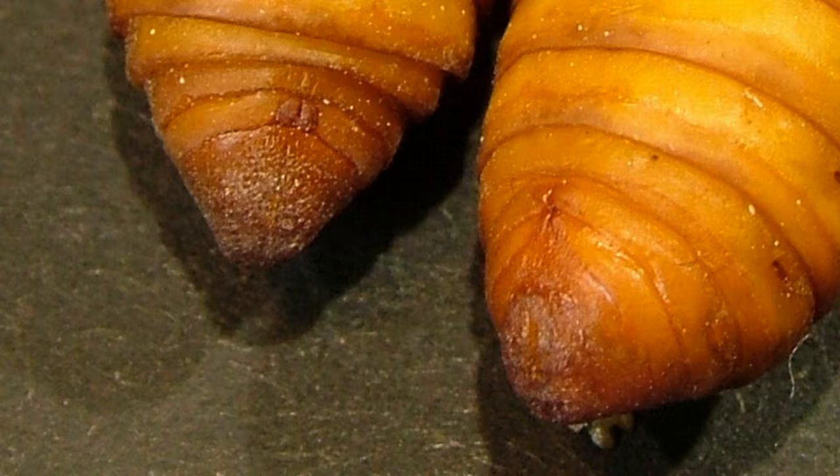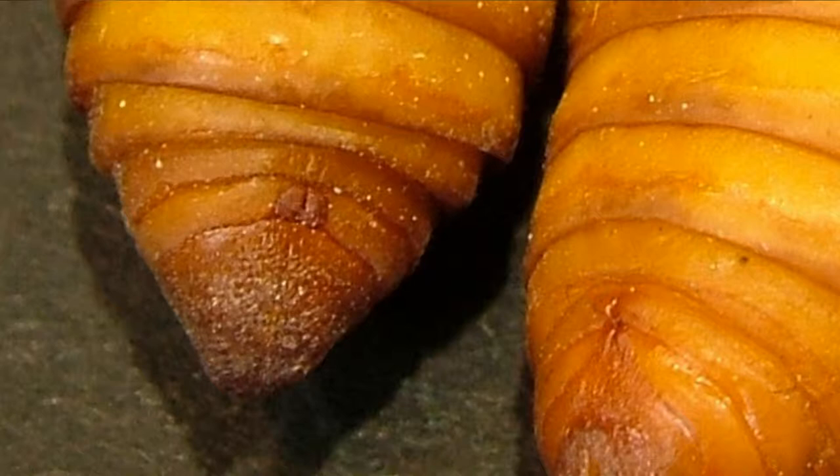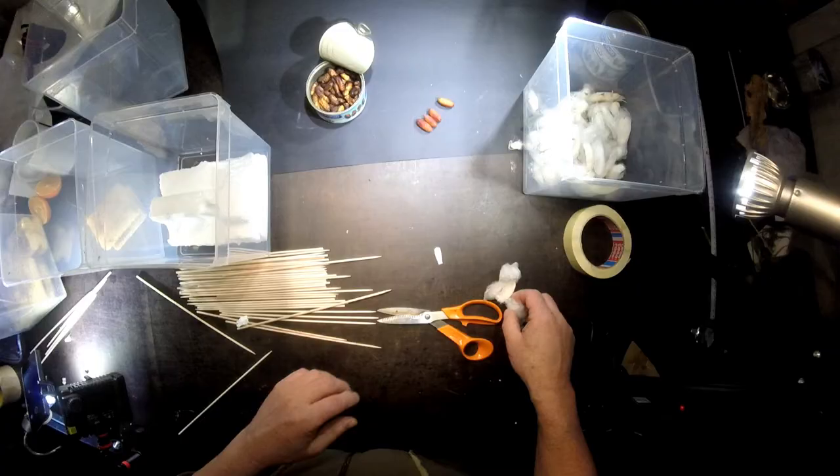Now I will show you a male. Let's see where I find it here. This is a female, this is also a female — so this must be the male here. Yes, here it is. With the male, this little point at the end is clearer and it has a little slit in the middle — so it's like a little heart with a slit in the middle. That's the sign of the male. You can also see it here on this photograph. If you do this for the first time, you have to use a glass to see the detail, but if you're used to it, that's no problem. After some minutes or so, you will find out whether it's a male or a female.